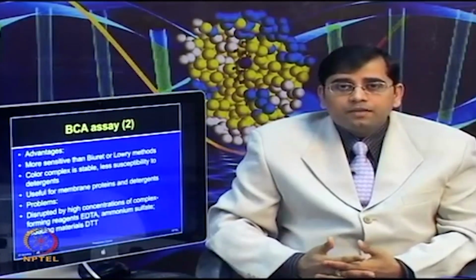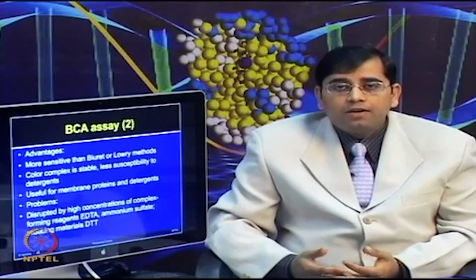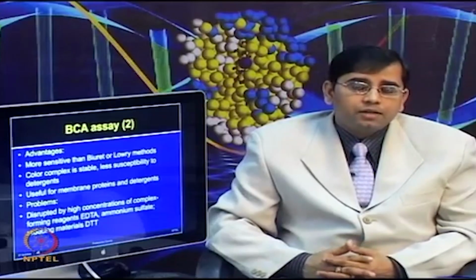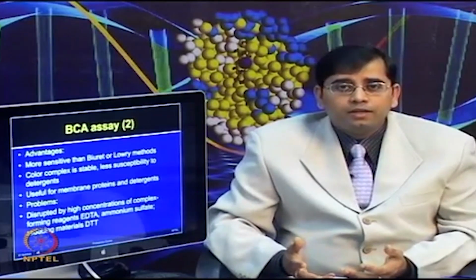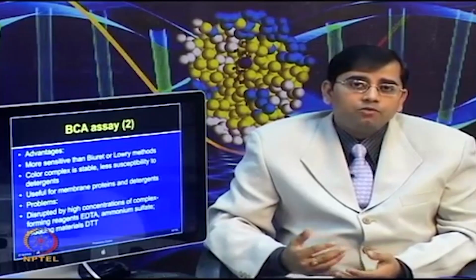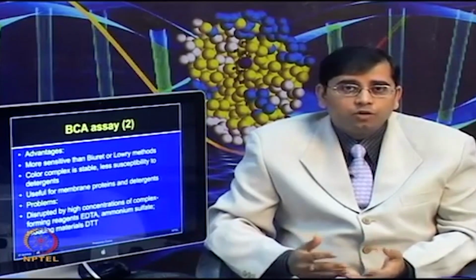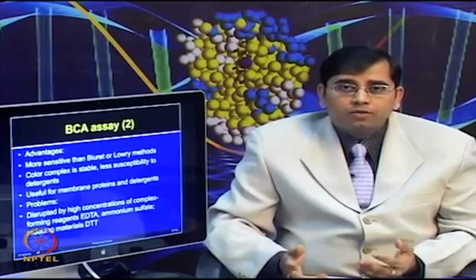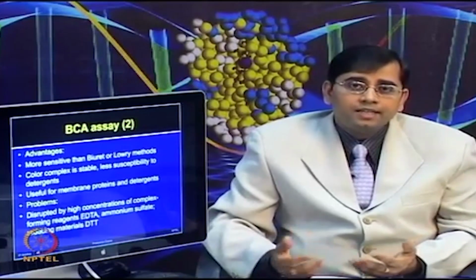So, people have tried different assay methods for protein quantification, because there are many interfering components which could give you a false reading, and if you are unable to accurately determine the protein concentration, then your whole analysis depends upon that, and it will not lead to the right results or right comparison. Many times you want to compare controls and treatments, your 50 controls with 50 disease samples.